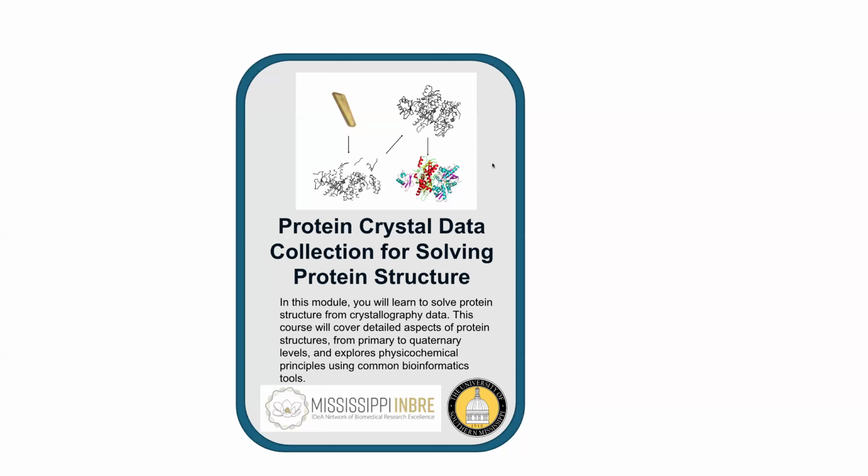So what we'll be doing for this module, the purpose overall of the module is to kind of give a crash course in how to use protein crystallography and how to use X-ray data to solve protein structures. There's a pretty big learning curve. I worked in research for 10 years before becoming a professor, learning how to do these things. And of course, the field evolves a lot. So a lot of what this is going to be will be pretty fundamental things as to how crystallography works.